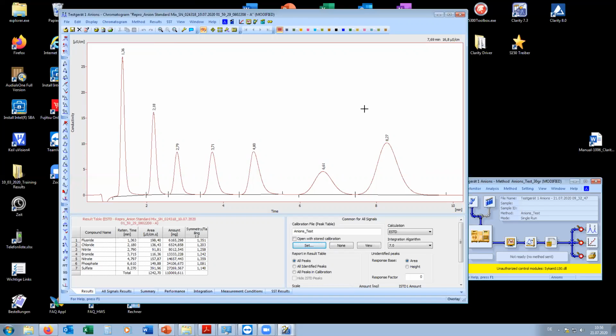But I would say to go for sure, in the manual there is the exact recipe of the standard mix. You should prepare it and do like a 5-level calibration run. And with those runs, you can update the calibration file. And once it's done, it's ready. Okay, sir.